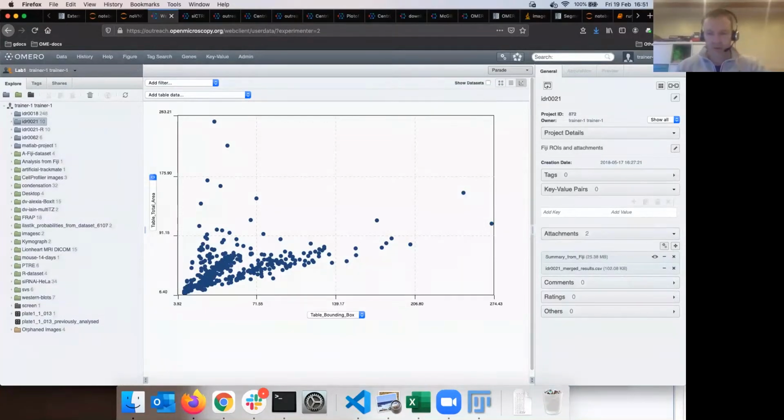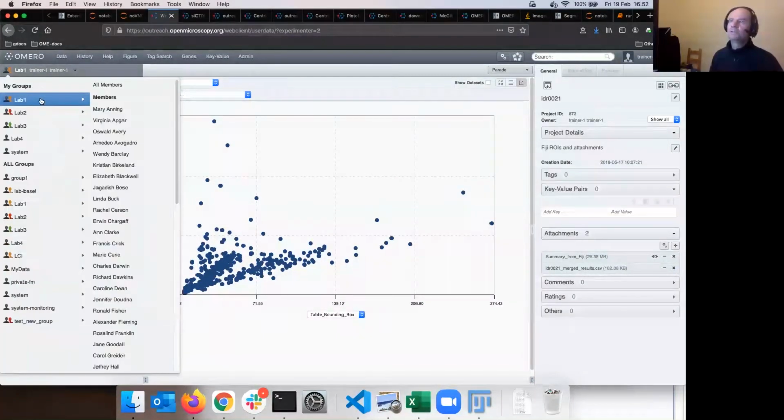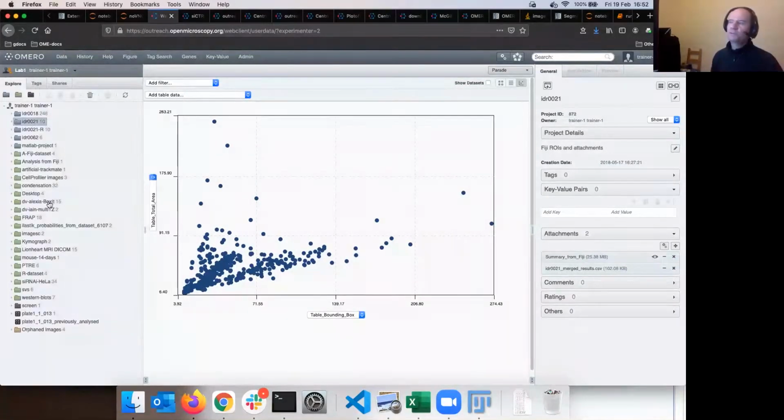That's an important point. I think you need to make sure that people are on trainer 1 to view what you're showing, Peter. Yes, they won't have that in their account. Whoever you are, you won't have that. Absolutely not. Yes, you are right. So just once more as a reminder, do go to the trainer 1 portfolio. If you are wondering where the data are and why your OMERO.parade shows such underwhelming graphs, then this is because you are not on the right data. It must show on the top left trainer 1, okay? On the top right, it will show Jane Goodall, etc., as appropriate, but on the top left, it must show trainer 1. And you must see a portfolio which looks identical to mine here. I have 5 projects and then some 20 odd datasets and 2 plates and 1 screen. So be there, don't be in your own portfolios.